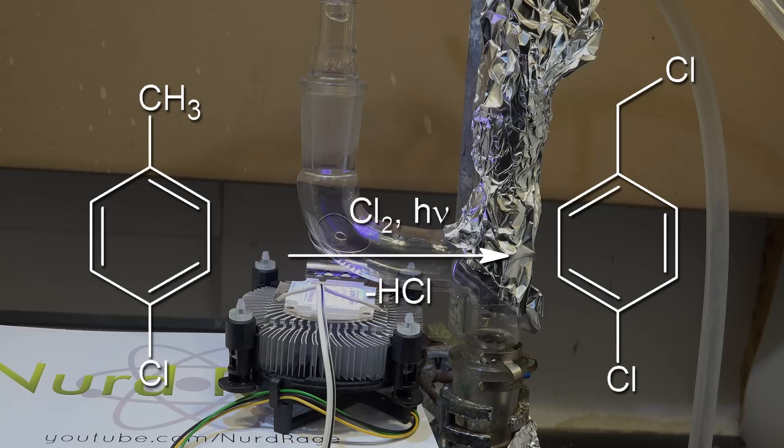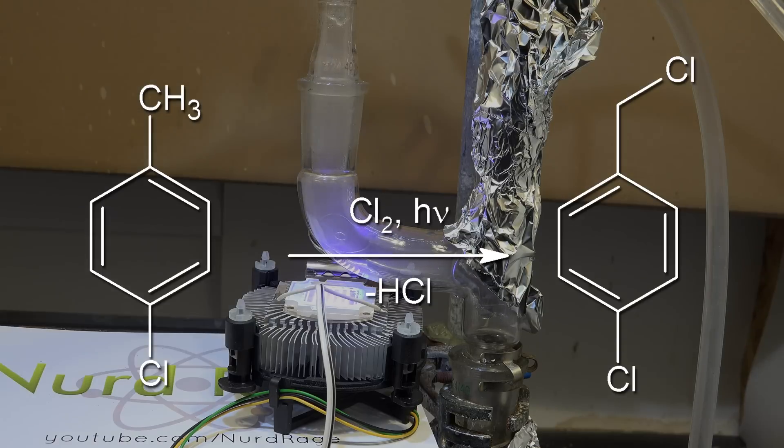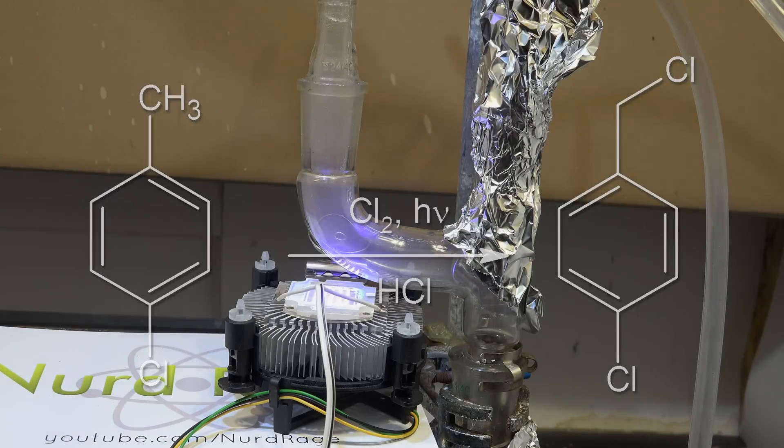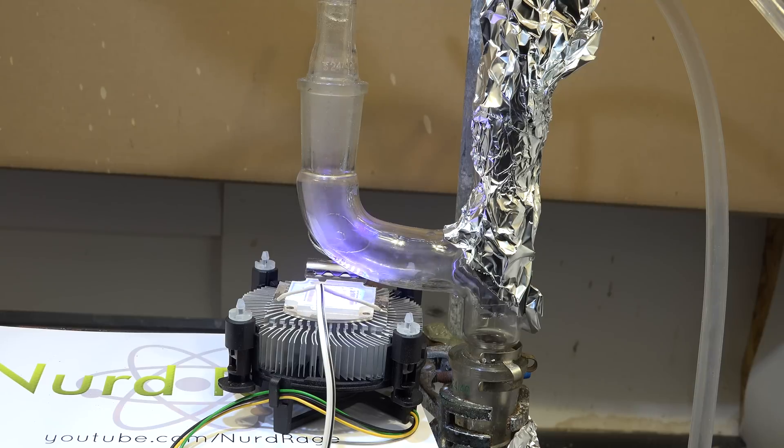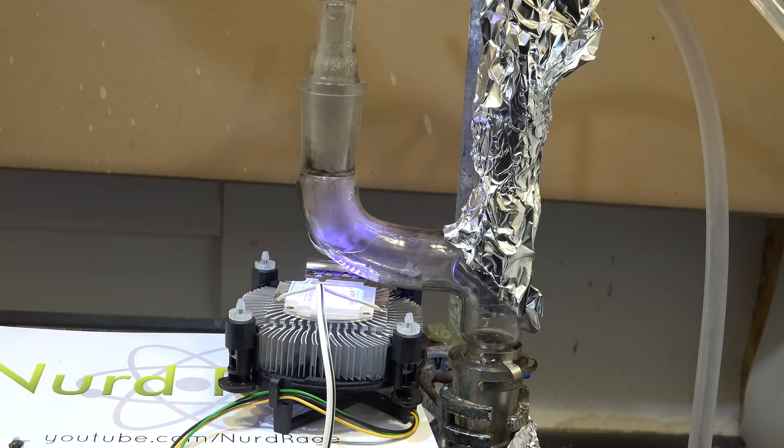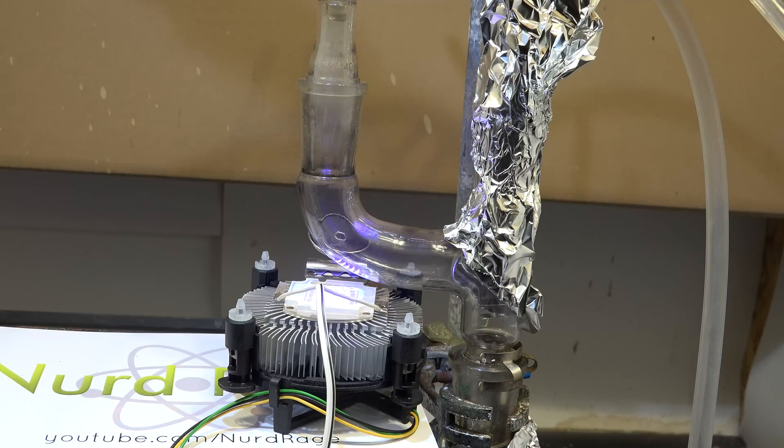What's happening is the ultraviolet light is initiating free radical chlorination. The light breaks up the chlorine into chlorine radicals. These chlorine radicals attack the methyl group on the p-chlorotoluene to form p-chlorobenzyl chloride as well as hydrogen chloride. The hydrogen chloride gas escapes out the top of the column but the high boiling p-chlorobenzyl chloride condenses and drips down into the flask. Since it has a higher boiling point than p-chlorotoluene it should stay in the flask and never get chlorinated.